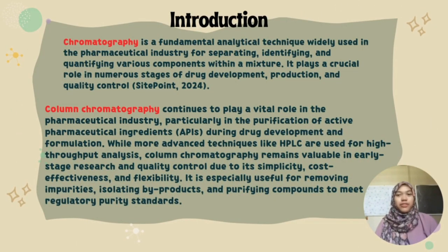Introduction. Chromatography is a fundamental analytical technique which is widely used in the pharmaceutical industry for separating, identifying, and also quantifying various components within a mixture. It plays a very important role in numerous stages of drug development, production, and also quality control. As for this presentation, we are focusing on the role column chromatography plays in the real pharmaceutical field.